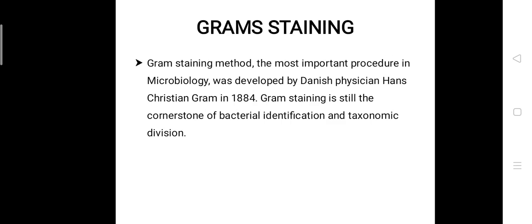This gram stain is a differential staining procedure which separates most bacteria into two groups, that is gram positive bacteria and gram negative bacteria, where the gram positive bacteria have a thick layer of peptidoglycan and the gram negative bacteria have a thin layer of peptidoglycan.